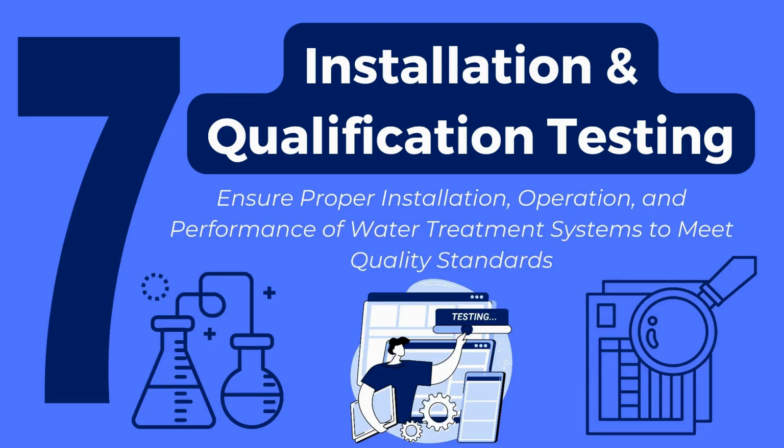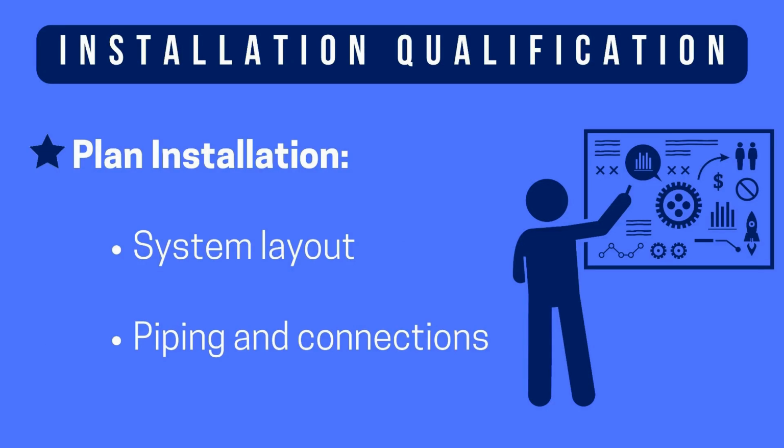In this video, we'll be diving into Step 7, installation and qualification testing. This step is essential to achieving and maintaining high standards of water quality. Let's start with installation qualification.